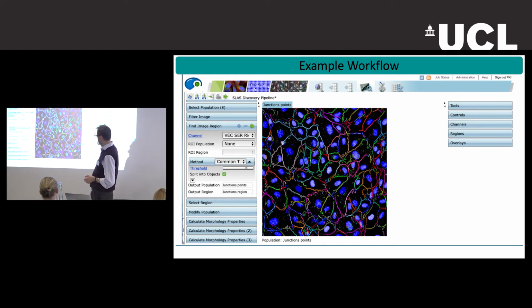And we have done this by filtering the image further and actually clustering, so subdividing the general junction structure that we see here in red. So as a generalized object, we basically found smaller objects which pertain to the generalized junction object. And you see then that these objects are a little bit more defined than the general one, since we can see that this is quite linear, this is quite linear, this is quite linear, and here we have a little bit of bits.